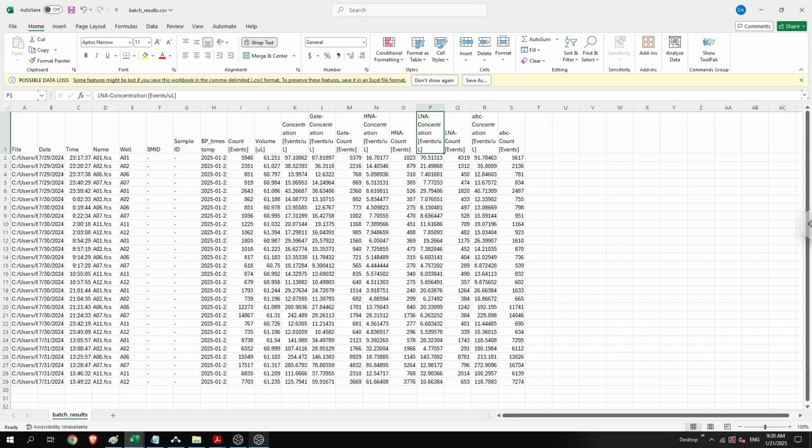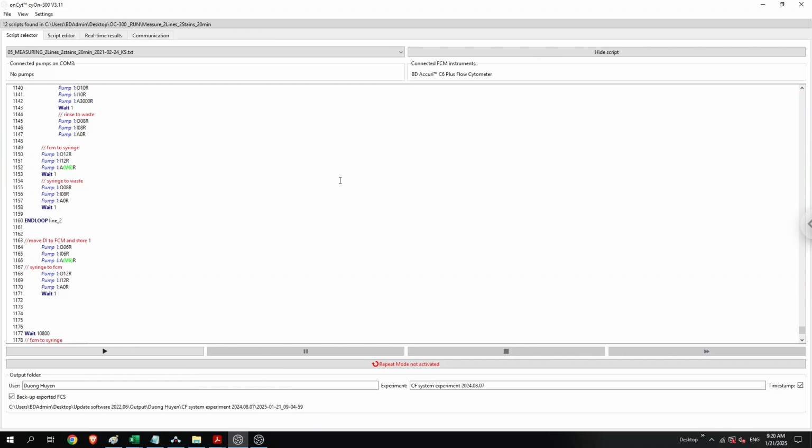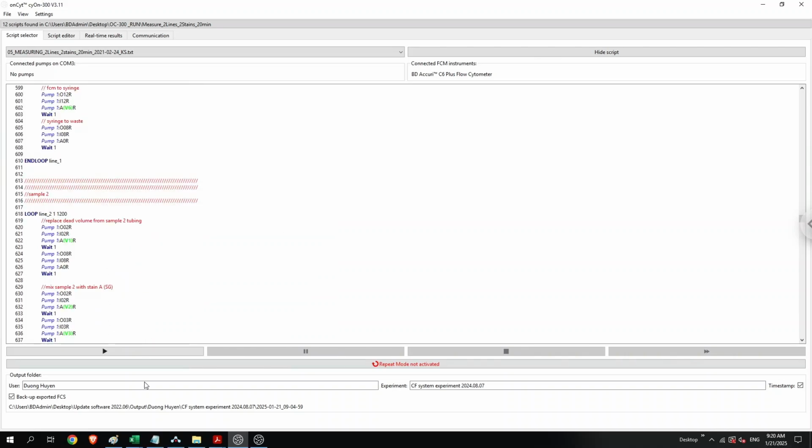Okay, I think that's pretty much everything you need to know before the training sessions. So when you understand it, I will just run the system and we will take less of our time. Okay.